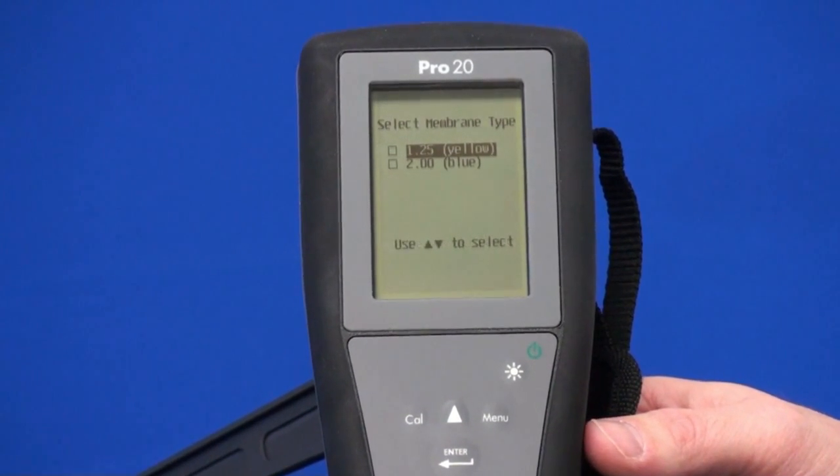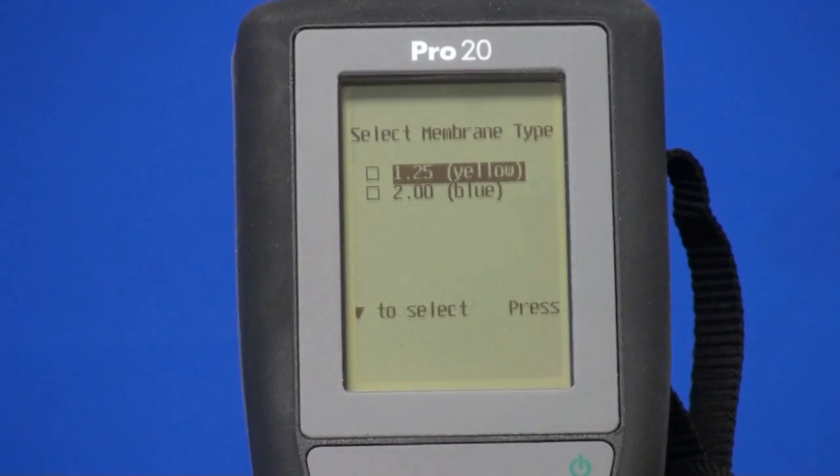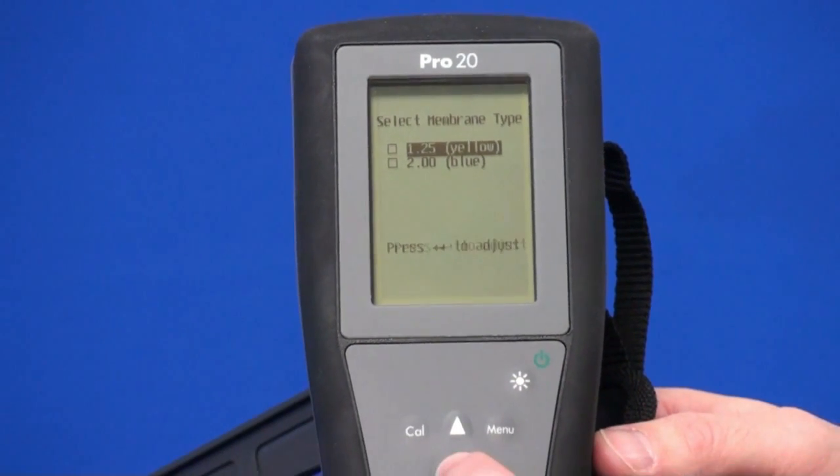Now it's going to ask you for the membrane type. We have a yellow cap membrane and a blue cap membrane. The instrument comes with a yellow cap membrane, so I'm going to go ahead and select yellow by pressing enter.